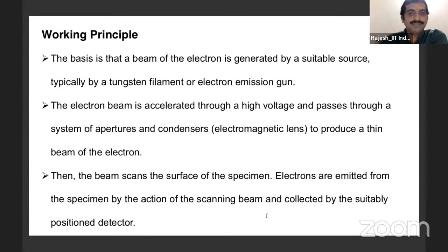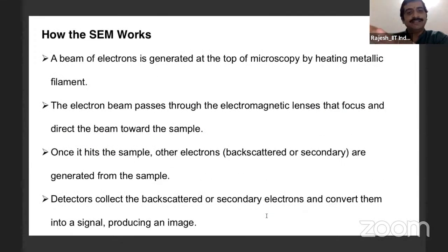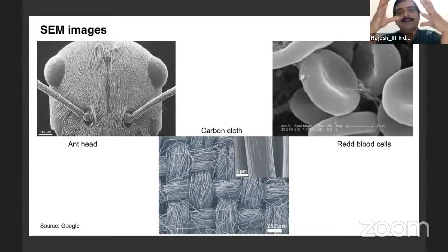ठीक, तो ये बेसिक प्रिंसिपल आई ऑलरेडी टॉक्ड अबाउट दैट. हियर अगेन the images are made based on the indirect information that we get from the surface.